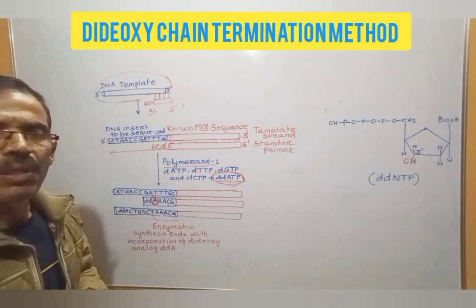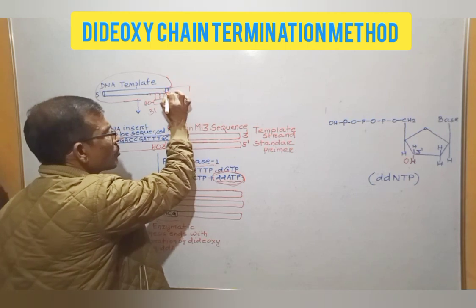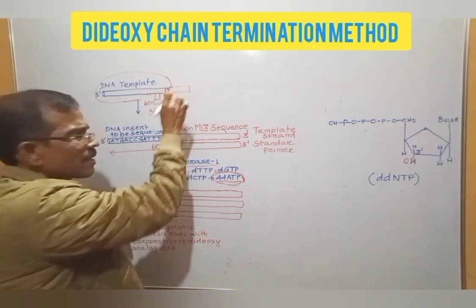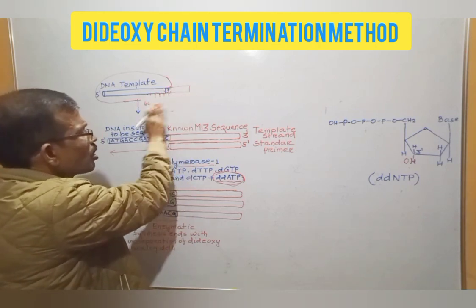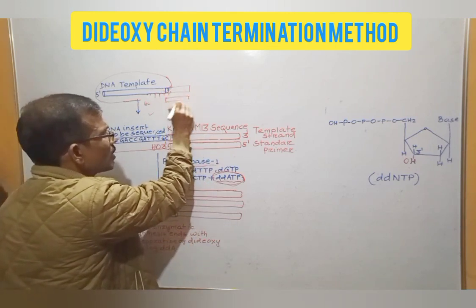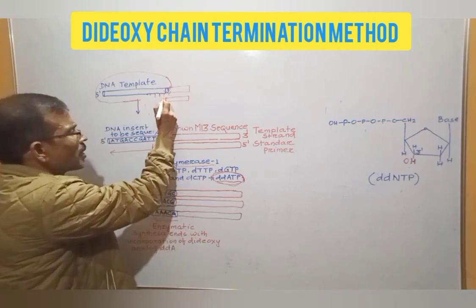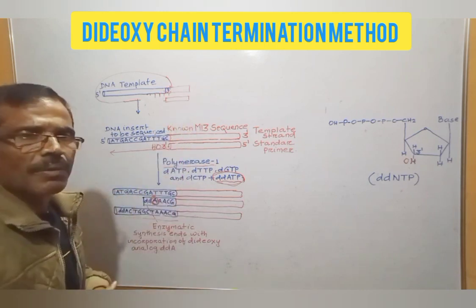This problem is overcome by joining a short DNA strand of known sequence to the 3' end of the DNA template. Because we know the sequence of the short DNA strand, we can develop a primer which is annealed to the 3' end. After annealing the primer, replication can be initiated by DNA polymerase.